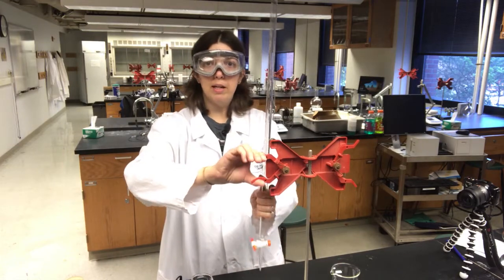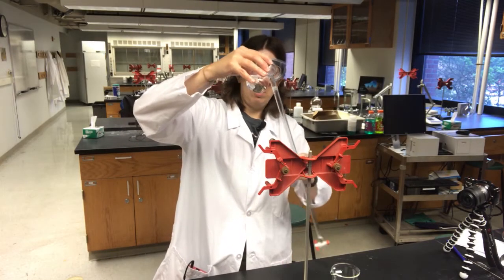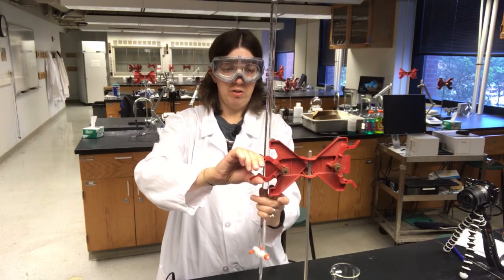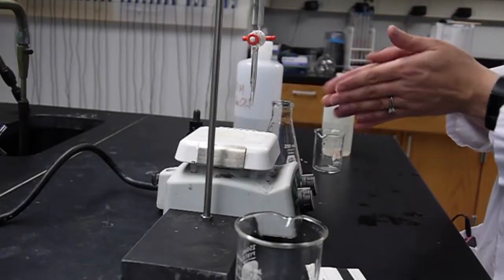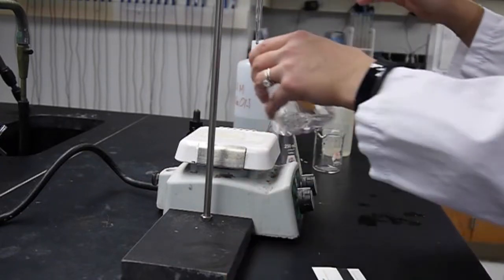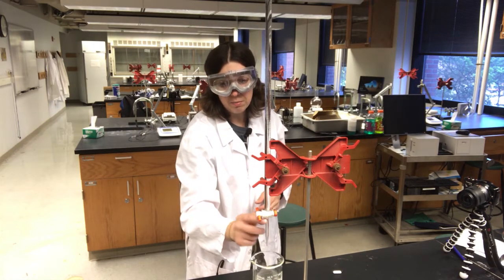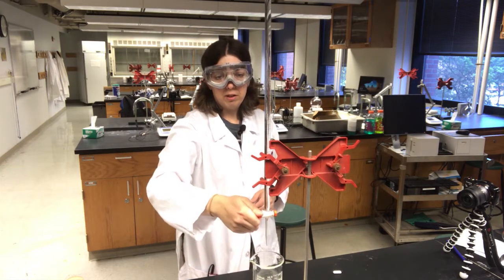Now it's time to fill the burette. I'm going to take it back out of the stand with the stopcock closed and carefully add sodium hydroxide. I've added almost 50 milliliters of sodium hydroxide — I want to make sure it's mostly full, but it doesn't have to be filled to the very top. Looking now, I can see that I have a bubble in my burette near the stopcock, so I'm going to empty a little bit of sodium hydroxide into a waste beaker and then check that there are no bubbles in the tip. It is very likely you'll see a bubble at the bottom of the stopcock — if that's the case, open it again full force, and sometimes spinning the stopcock around helps loosen the bubble.